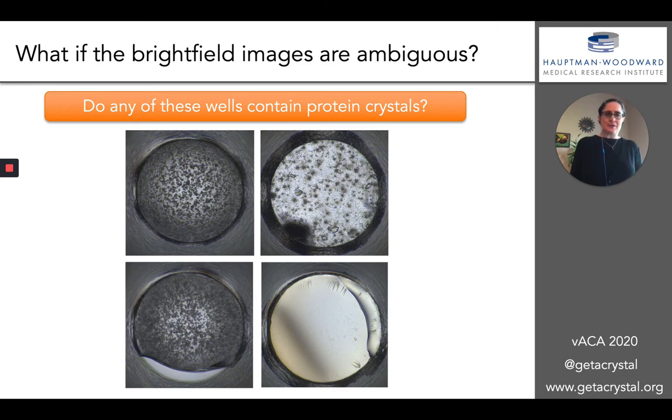But I'm pre-recording this, and so I'm just going to tell you at the outset that all 4 of these wells contain protein crystals, but each of these would be somewhat difficult to identify using just bright field images.